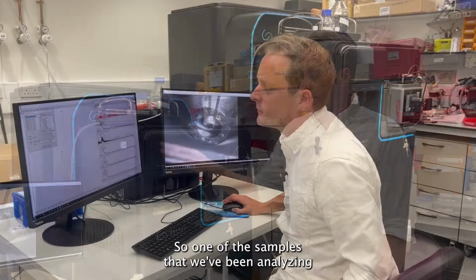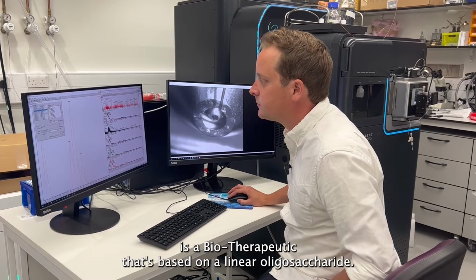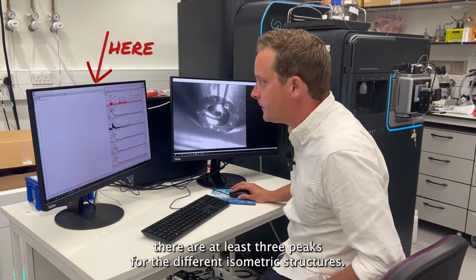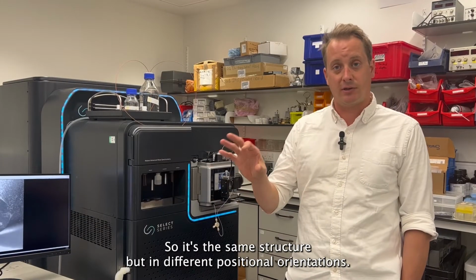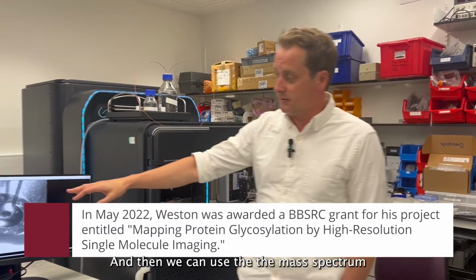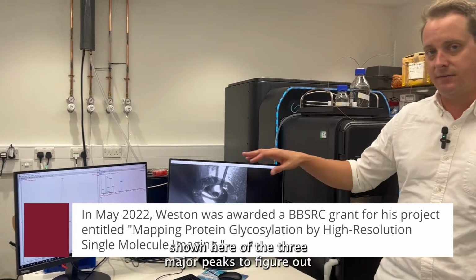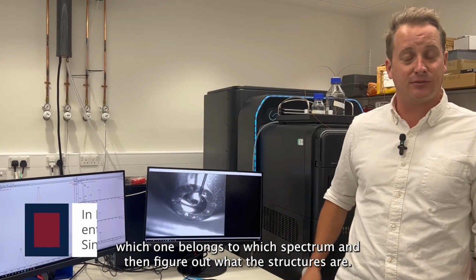So one of the samples that we've been analyzing is a biotherapeutic that's based on a linear oligosaccharide. And you can see that there are at least 3 peaks for the different isomeric structures. So it's the same structure but in different positional orientations. And then we can use the mass spectrum shown here of the 3 major peaks to figure out which one belongs to which spectrum, and then figure out what the structures are.